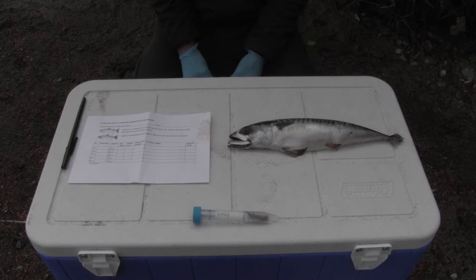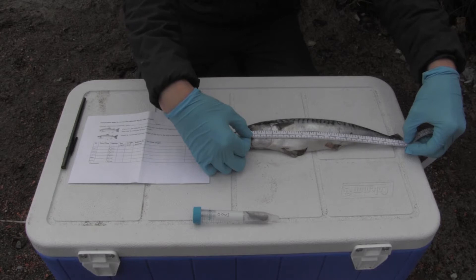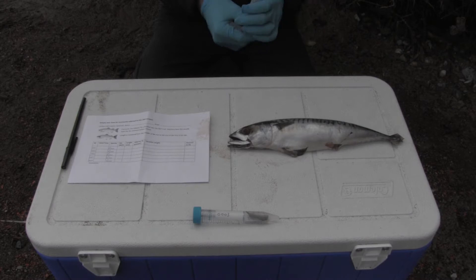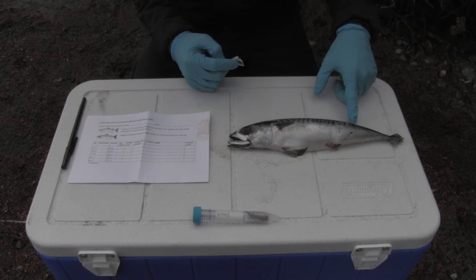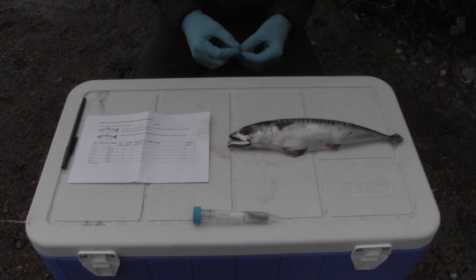We would also like you to record the length, and we are using something called fork eye length, which is the distance from the middle of the eye to the fork in the tail. We'd also like you to record whether or not there is an adipose fin present. An adipose fin is a fin on the back of some fish, including many salmonids. Hatchery-born individuals often have this fin removed to identify them as hatchery born, and this is a piece of information we'd like to know.